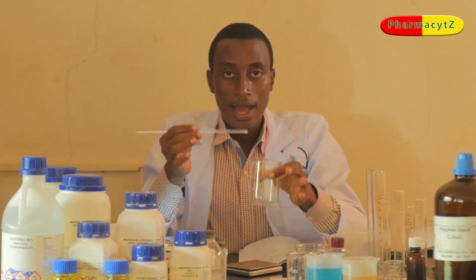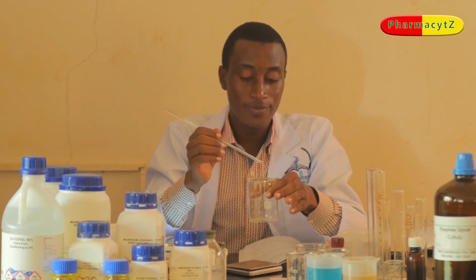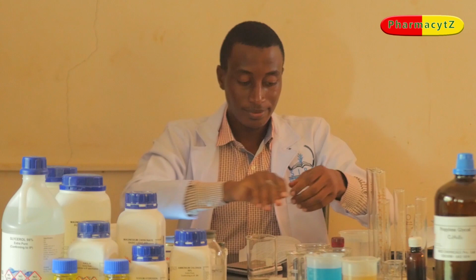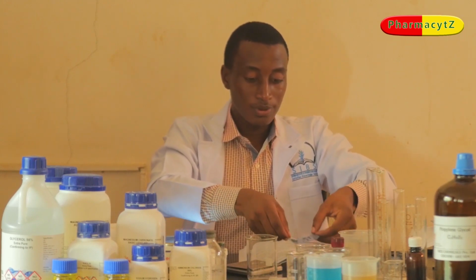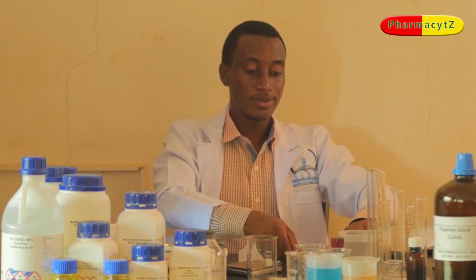Now, iodine can dissolve in this solution of potassium iodide, contrary to what I did first. So this 1 gram of iodine is going to dissolve in this preparation. My table is very clean, so I'm going to dissolve it in this solution.